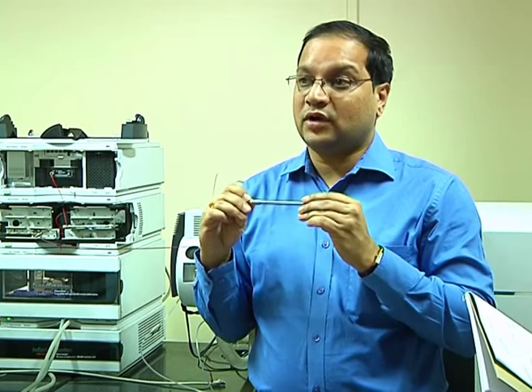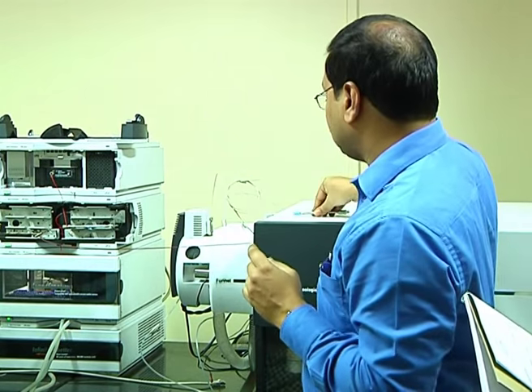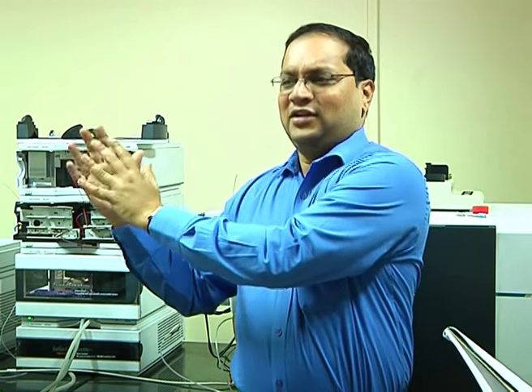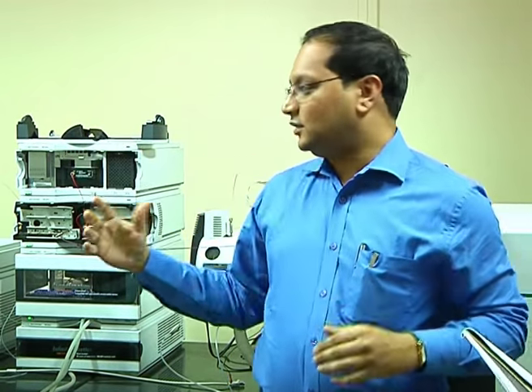So it gets retained based on hydrophobicity, and then you elute those peptides at different time intervals. So of 10,000 peptides, 2,000 will come at 1 minute, the next 500 will come at 2 minutes, like that. Then you split all those things, and your MS can see them with its full capacity, and you won't miss them. That is one, you reduce the complexity.